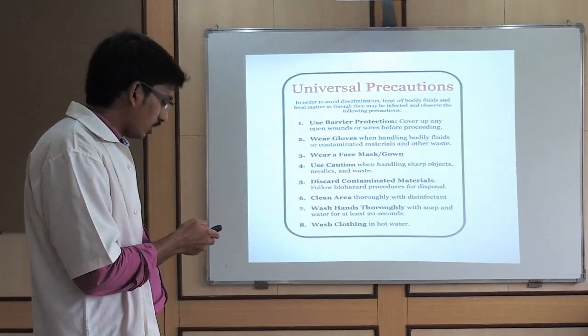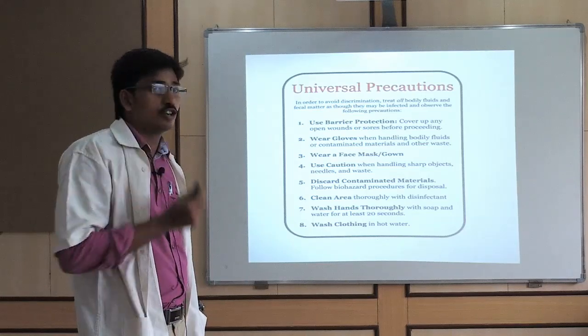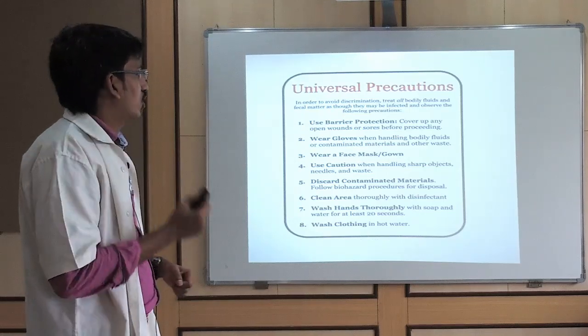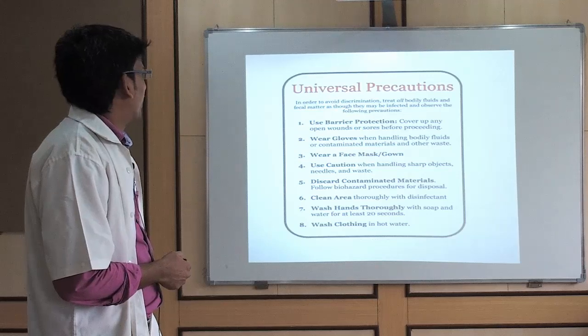Before going to the topic, we should know something about universal precautions. Without any universal precautions, we don't go for any other work, mostly in hospitals. And what are the universal precautions you should take while collecting samples? First one is to use barrier protection.